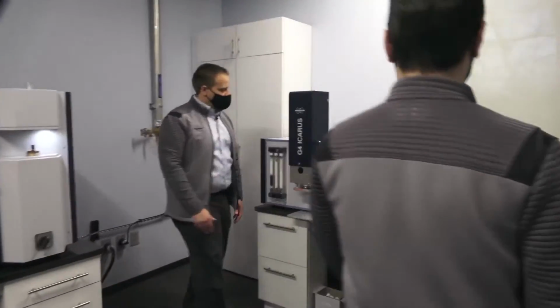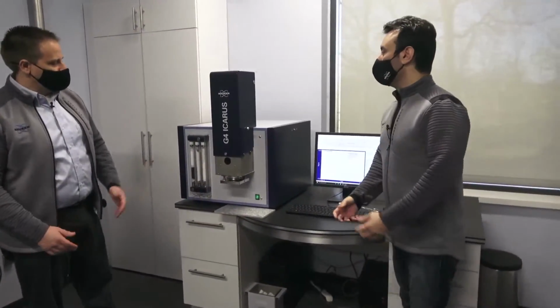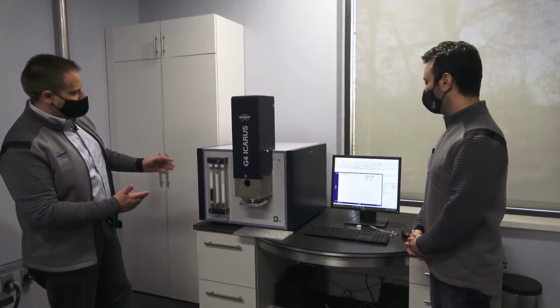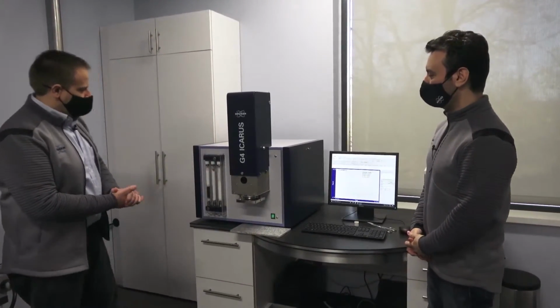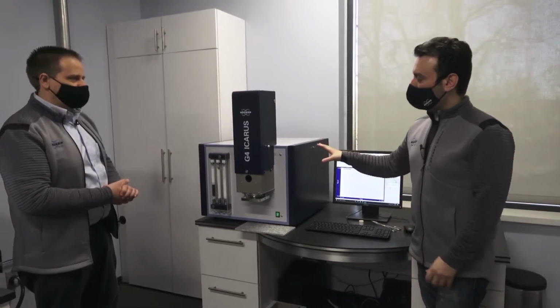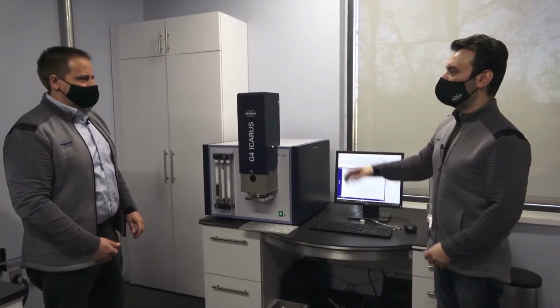So here we are in the combustion gas and fusion analysis lab. This machine, it says the Icarus. Yes. So which kind is this? Is this the combustion gas or is this the fusion? So this is a combustion analyzer to detect carbon and sulfur in solid pieces.